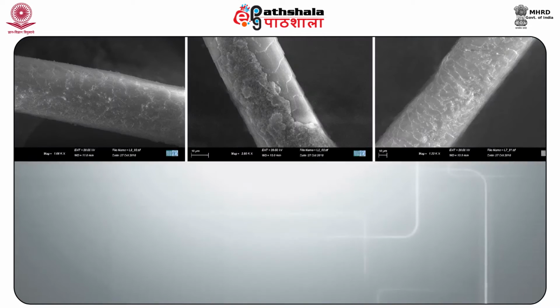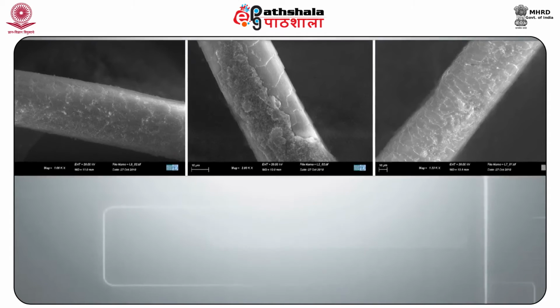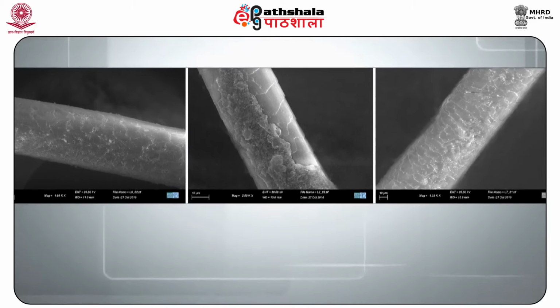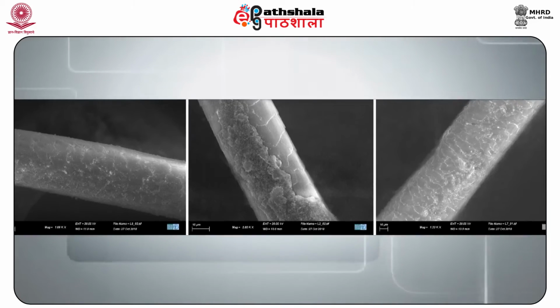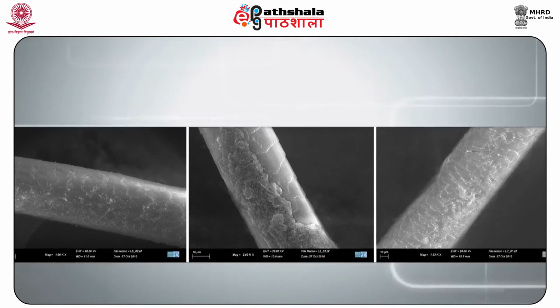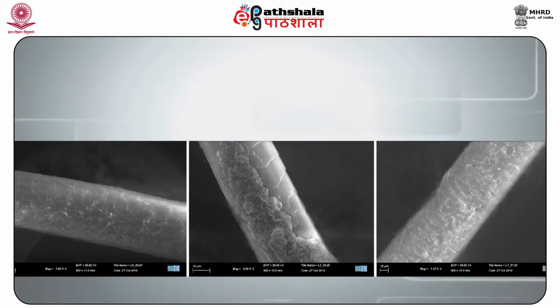Next comes the comparison microscope. While comparing microscopic characteristics here, we need a high quality transmitted light microscope. The high quality objectives are very important. The objectives and the eyepieces selected should permit observations in the range of approximately 40x to 400x.